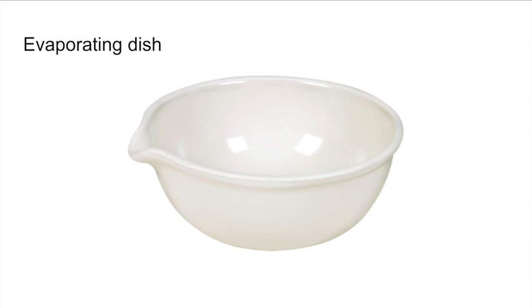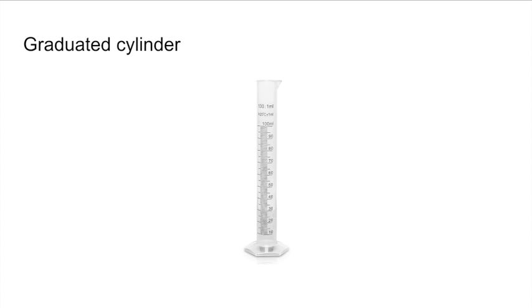And now we'll be having Catalina with the graduated cylinder. Narrow cylindrical shape. Each marked line on the graduated cylinder represents the amount of liquid that has been measured. A traditional graduated cylinder is usually narrow and tall so as to increase the accuracy and precision of volume measurement. It has a plastic or glass base and a spout for easy pouring of the measured liquid.